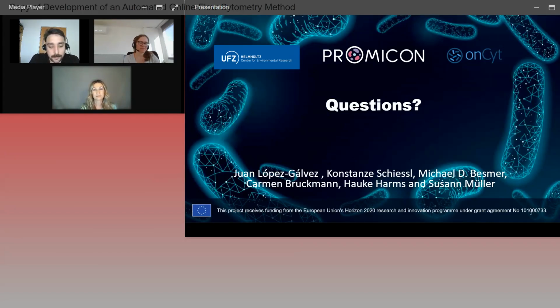Yes, that's the good thing that DAPI offers. DAPI is a dye that has high resolution. This also allows us to monitor how the DNA quantity in each cell changes, and this allows us to monitor how the cell progresses in a growth cycle.